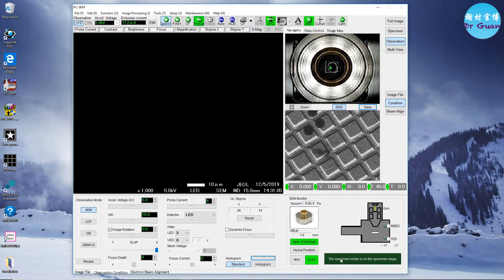You can also check that all the stage readings are zero and that there is a 40 millimeter indicator showing good.